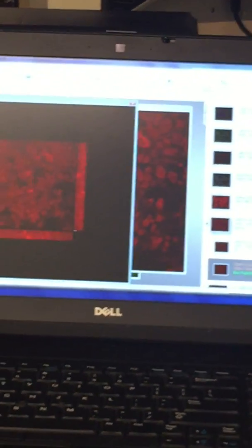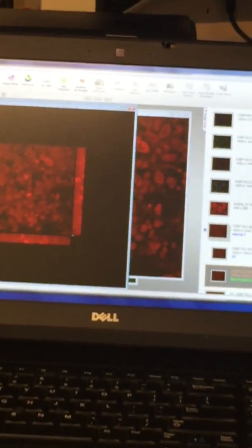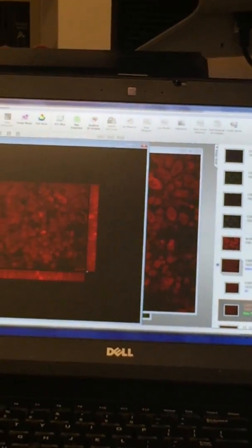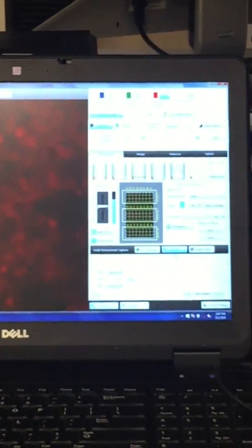You can use a Z-Stack with any type of dish, right? Sure, just slides, whatever. Yeah, that's all I bring with me is slides to demo. But you can put in dishes, plates, even a flask if you want. Sure. Okay. So that's how you guys set up a Z-Stack.